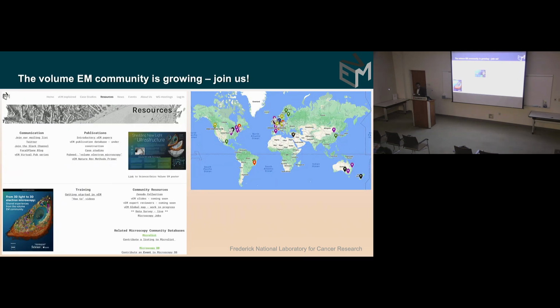The community is growing, so I'm deeply involved in building the volume EM community. For those of you who want to get involved, please contact me. There's a great website, volumem.org. It's all community driven, where you'll find many resources, including the Slack channel, email list, a set of publications, some basic training videos. We still need to do some work here, and some community resources.